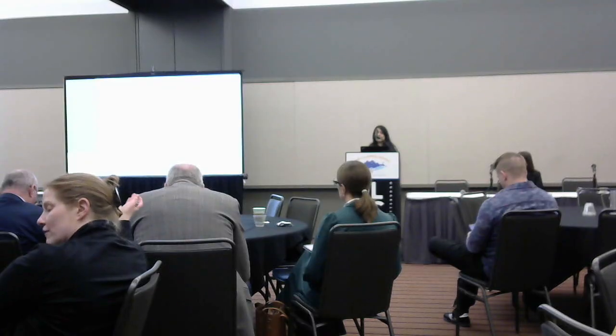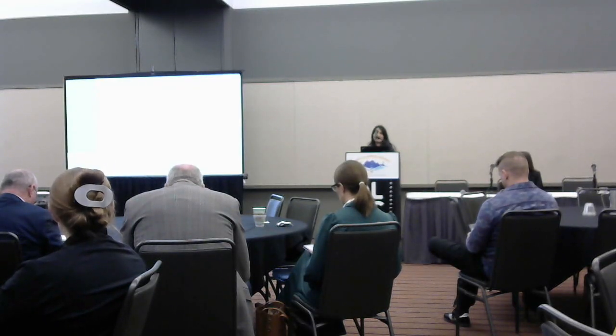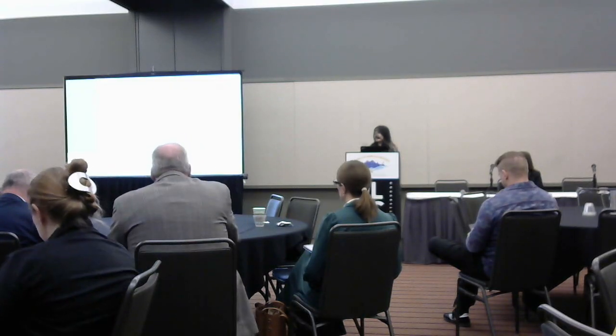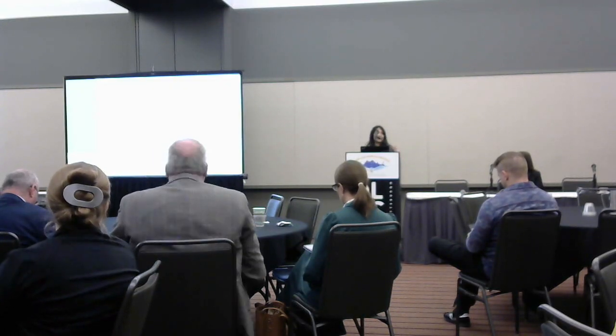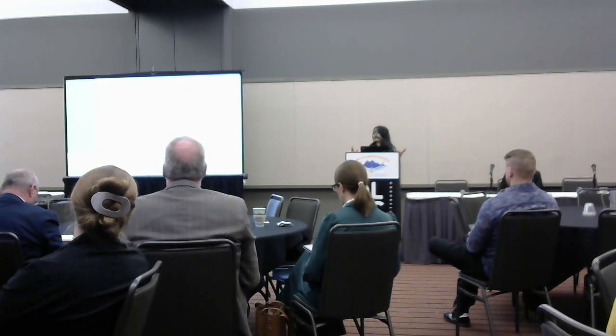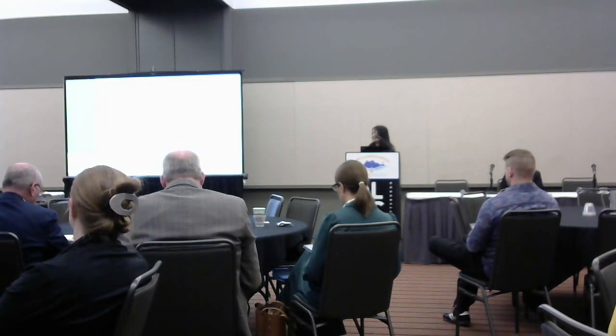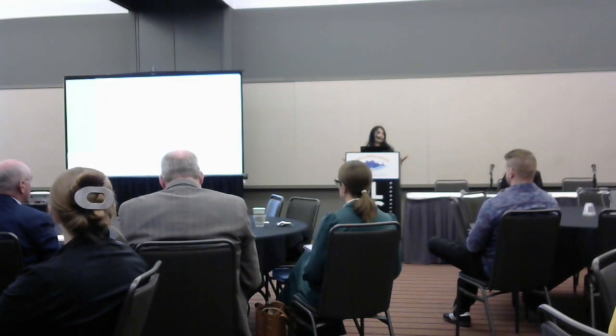So the average raw data that comes out of this instrument is in a scale of terabytes. It's not a few gigabytes anymore. And this terabyte is very easily acquired in less than 3 hours. So that is one high-resolution image of a whole mouse brain in just 3 channels. So acquisition is not the slowest part of our pipeline anymore.